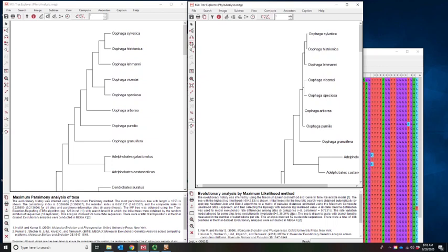I'm going to show you one last thing here before we go. Sorry, hover over that. We can flip this. Oh, that's the one that I wanted to show you. Flip the selected subtree. So Pumilio's at the bottom. Now it's at the top. But we're not changing relationships. We're just simply organizing it in a way that might be easier for you to read.